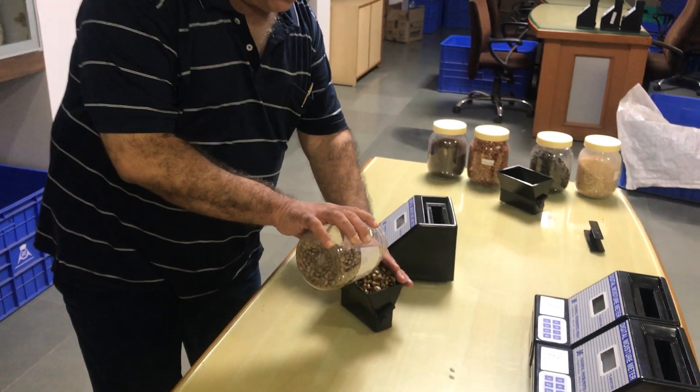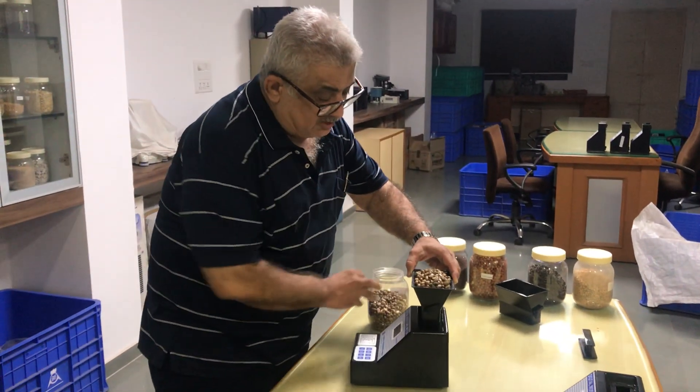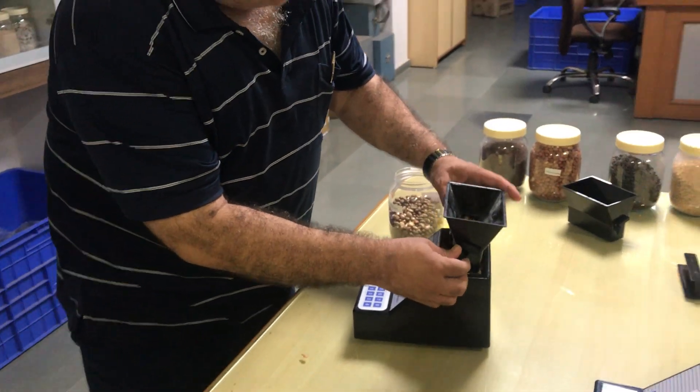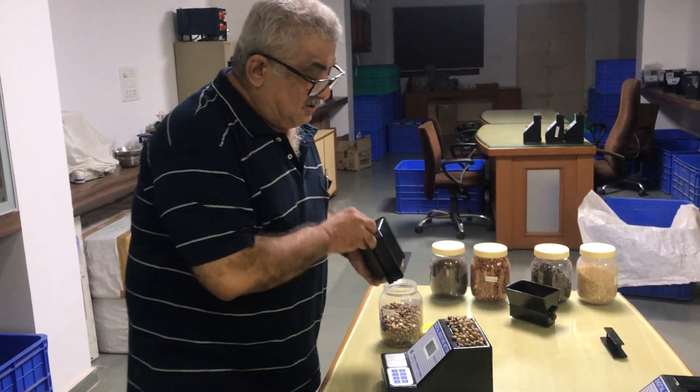You have to fill the castor seed this way. Then you have to see that the right side lever of the hopper comes down. You just drop the lever down, and this will be filled with the castor seed.